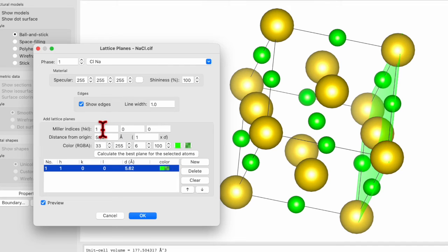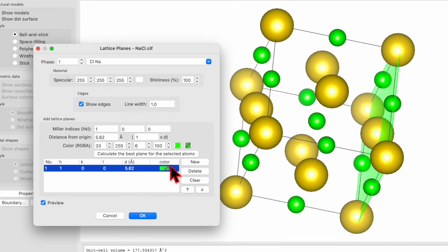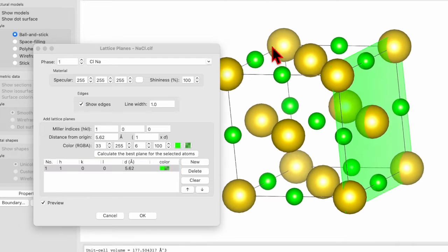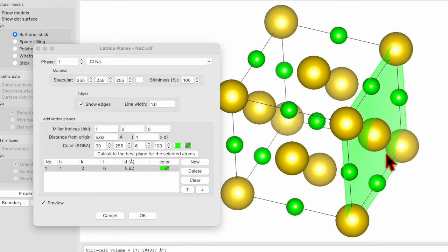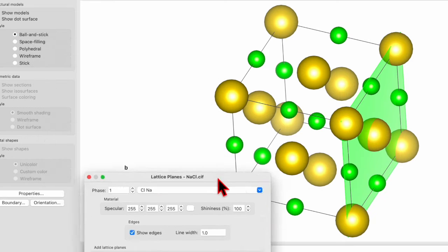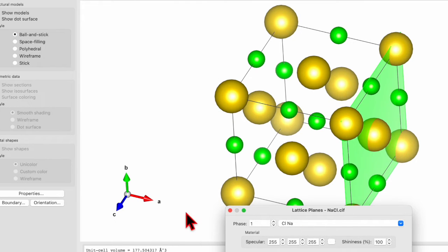And this is the hkl 100 plane and the color is green. So if you move the unit cell, you can see this is along the x-axis, which can also be visible from this compass. So this is pointing toward the a. This is the 100 plane.